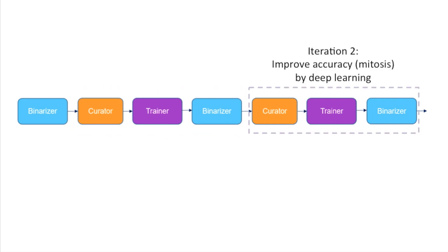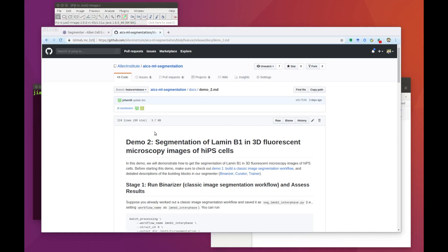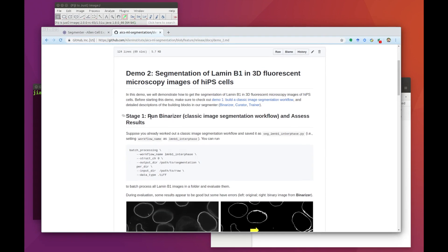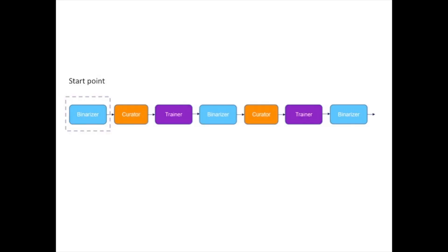Then we'll improve performance of that segmentation algorithm by applying a deep learning approach. We'll combine those results from the first deep learning model and a segmentation from another classic image segmentation workflow that's been optimized for mitotic cells to train a second deep learning model, which will pick up both interphase and mitotic Lamin B1 cells. For the sake of simplicity, we're going to assume that we've already worked out our classic segmentation workflow, and we're going to begin this demonstration by running our classic segmentation workflow from the command line.